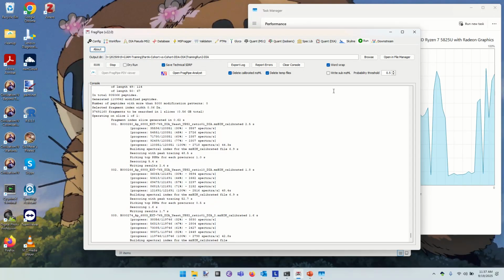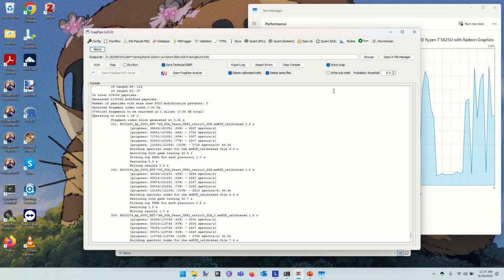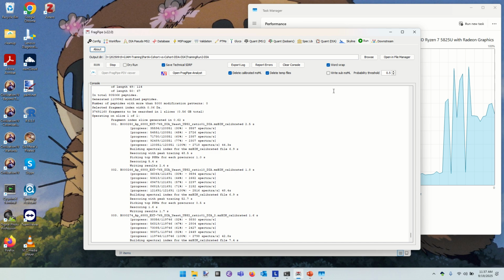Trying to think what other things I would mention about these along the way. I would say that DIA data analysis is actually really pretty new for me. I was in the camp of people who said that you could never identify as deep a proteome in a DIA experiment as you can in a DDA. And the field has proven me completely wrong on that score.